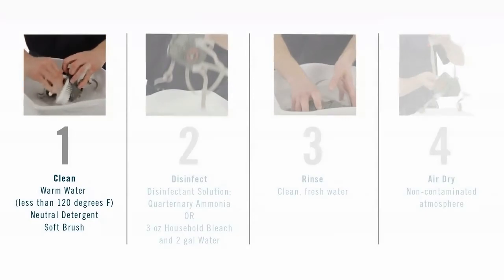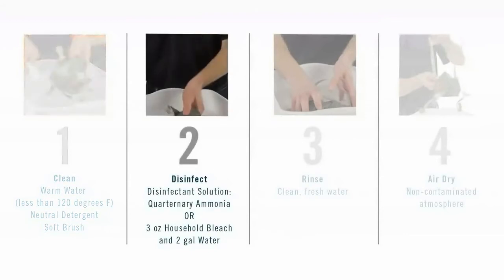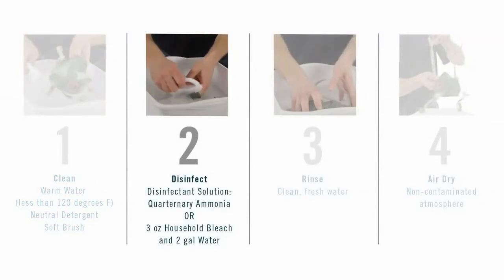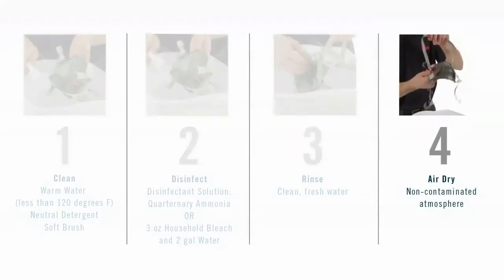Scrub with a soft brush until clean. Add neutral detergent if necessary. Do not use cleaner containing lanolin or other oils. Disinfect the facepiece by soaking it in a solution of quaternary ammonia disinfectant or sodium hypochlorite or other disinfectant. Rinse the facepiece in fresh, warm water and air dry in a non-contaminated atmosphere.